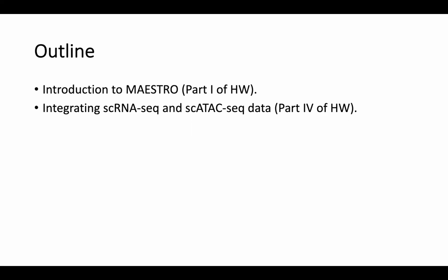And then I'll also talk a little bit about part 4 of the homework, which is integrating the single cell RNA-seq data with the single cell ATAC-seq data. That's partially graduate, but there are some undergraduate parts as well, and so everybody will probably benefit from that. I don't expect these slides to take much more than 30 minutes.